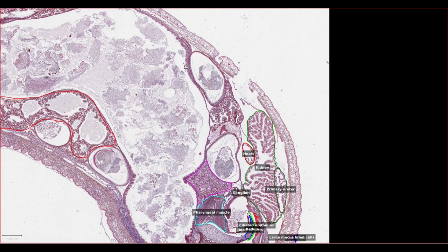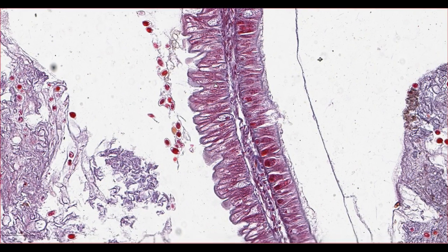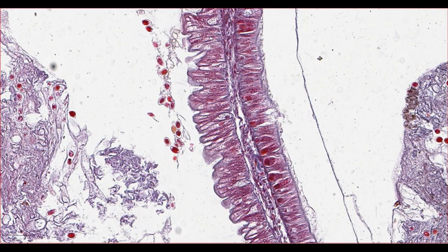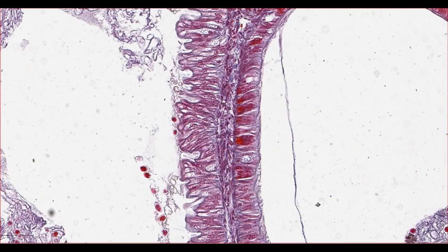If we zoom in, we can see that they're lined by large columnar cells. Some of them appear to contain mucus, like this one here. Another kind of goblet-looking type cell here, just as in the intestines of other species that we've looked at.